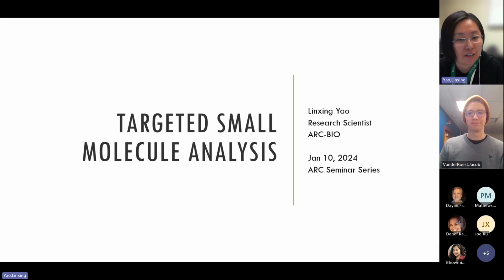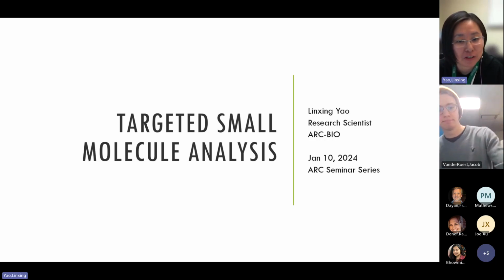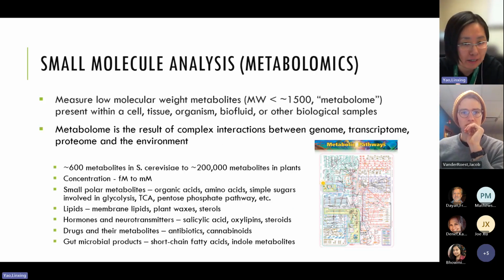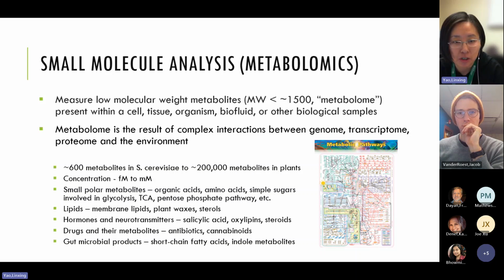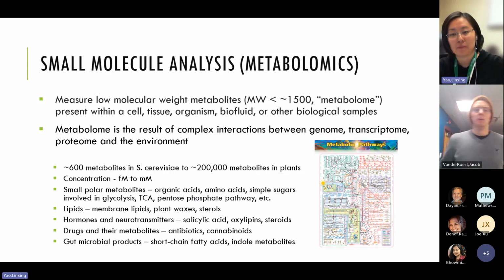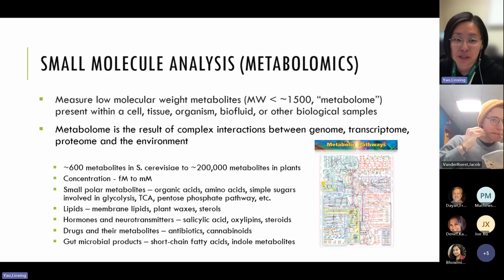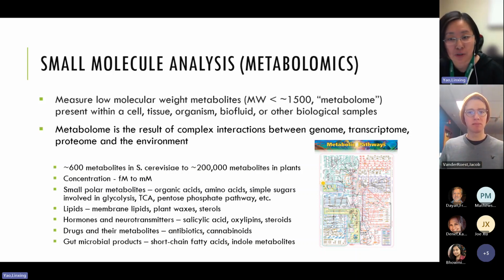I'll start today's talk, targeted small molecule analysis, with first, what is small molecule analysis. This is a type of analysis that measures low molecular weight metabolites that are present within a cell, tissue, organism, biofluid, and other biological samples. These small molecules and their interactions are known as a metabolome. The metabolome is the result of complex interaction between the genome, transcriptome, proteome, and the environment.